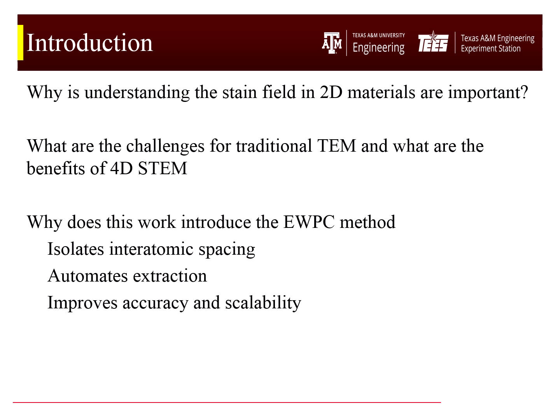2D van der Waals materials have captured tremendous attention because of their unique optical, electronic, and mechanical properties. However, these properties are not static. They are strongly influenced by the local strain field within the material, straining atomic spacing and lattice symmetry, leading to changes in band structure, optical transition, and even mechanical strength. Therefore, accurately mapping these local strain fields is critical to tailor material property for real-world application in electronics and photonics.